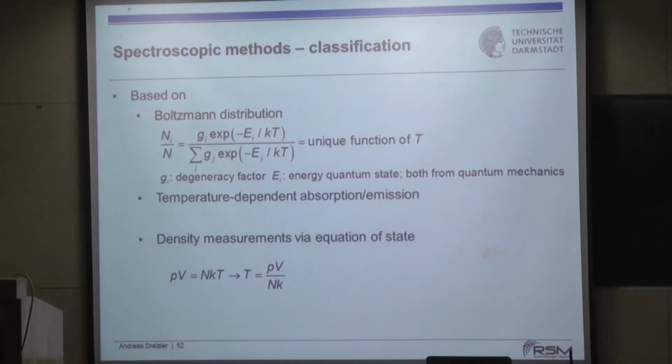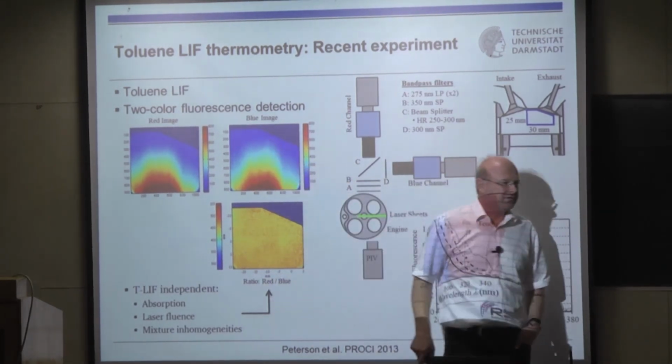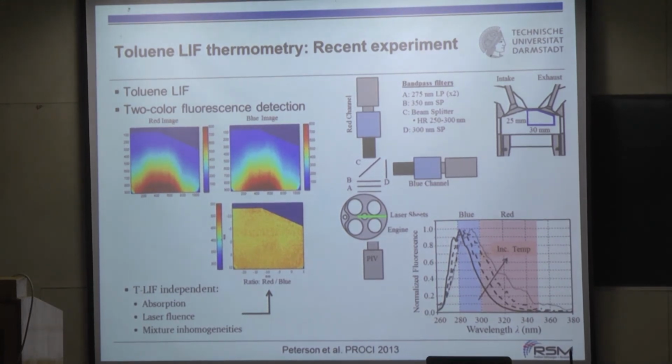That's one limitation. The other limitation is the absorption. If you have, let's say, the possibility to bring in more toluene over the saturation value, for whatever reason, you might have so strong absorption that at these locations here, there's almost no laser energy left, and that you can't measure there. Yeah. So it's, again, the devil of diagnostics is you have to find a trade-off. You can optimize it, and you can improve it by that, but you have your limitations.